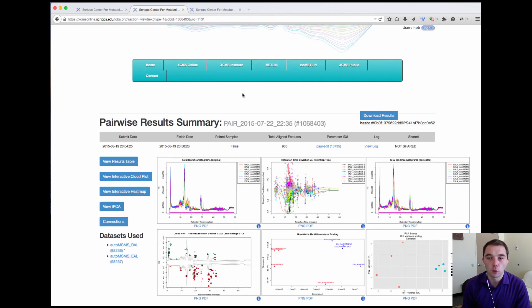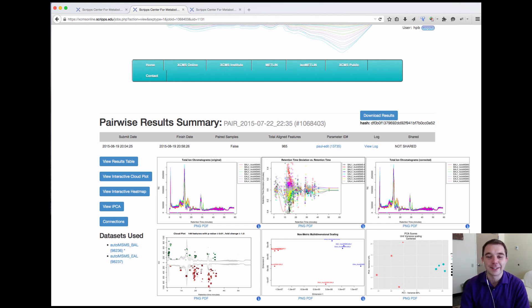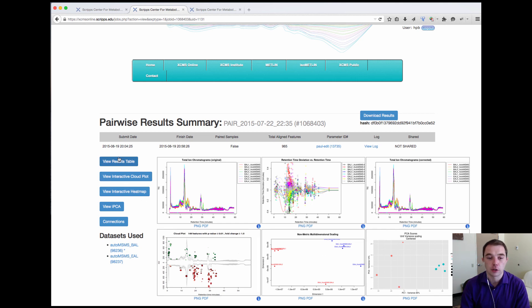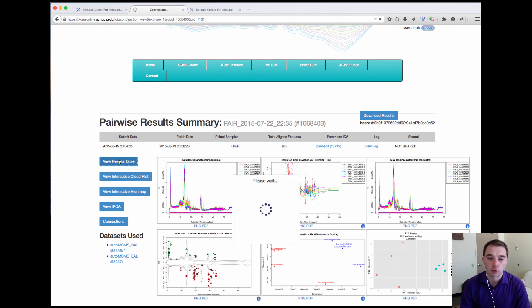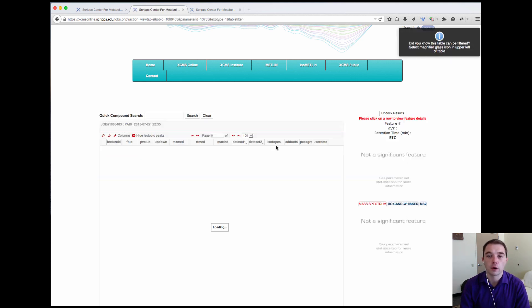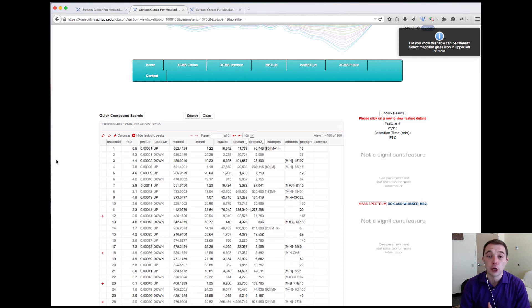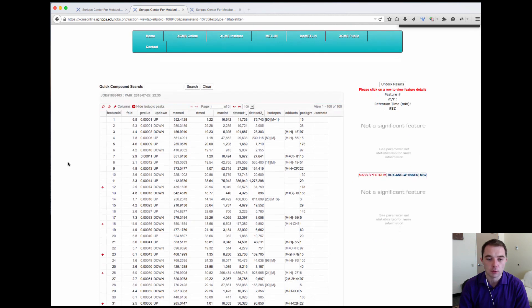You're met with a normal familiar six panel plot of my TICs, my retention time plot, my PCA, my cloud plot, but if we go to the results table this is where some of the changes have been made.